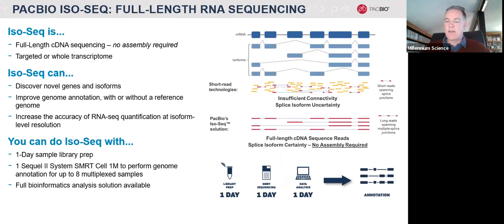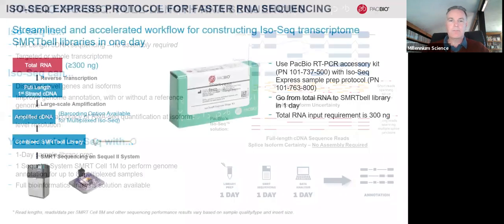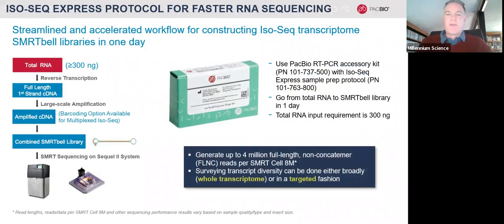The great thing is too that the bioinformatics is kind of being handled for you as well. There's pipelines available already programmed in SMRT Link to handle the analysis, to essentially tidy up all those isoform reads and map them back if you wish, and do a count and tell you what isoforms are available for each gene. So fortunately, with all of these things these days, there's a kit for that.